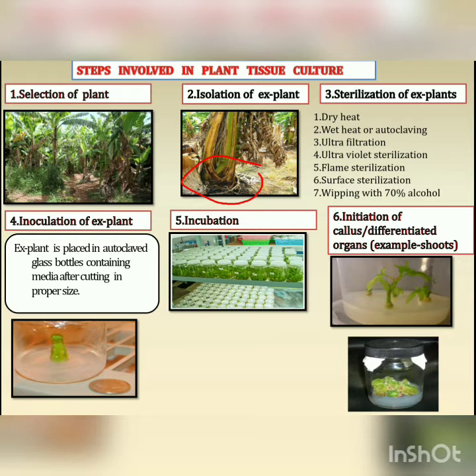If we have inoculated the explant, it is the first stage, and after some time we do the second stage. Between the first and second stage, the second and third stage, and so on, we keep these bottles in the growth room so they have enough time and controlled temperature to grow and develop properly.